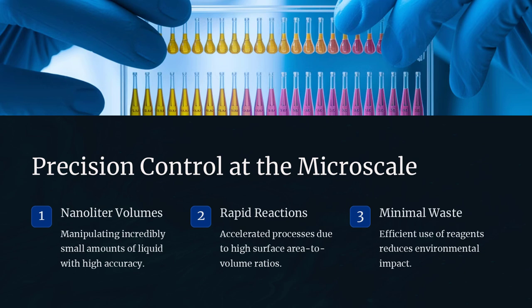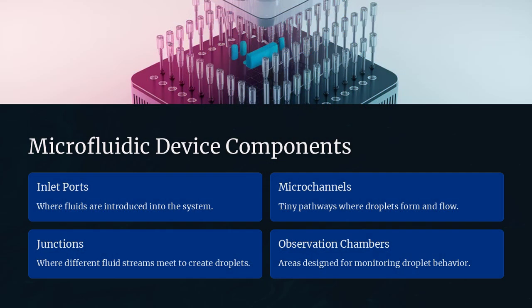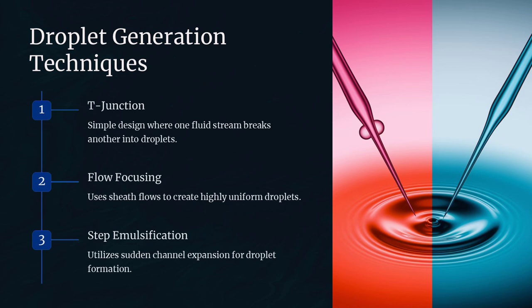One might ask, how could the introduction of a novel material, such as a graphene-based coating, revolutionize droplet formation and stability? The answer is that such advanced materials can dramatically enhance the channel's properties by improving its thermal conductivity, chemical resistance, and surface uniformity, thereby facilitating even more precise control over droplet behavior, though they also pose challenges in terms of integration and cost. The most effective microfluidic systems harmonize both chemical and physical strategies to achieve droplet stability that is greater than the sum of its parts.